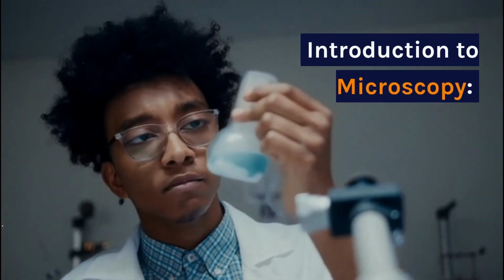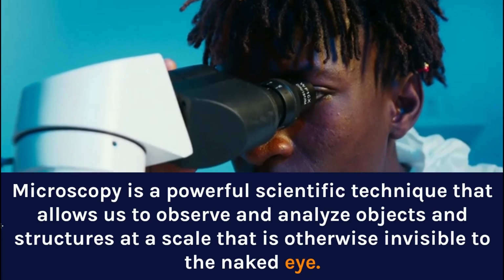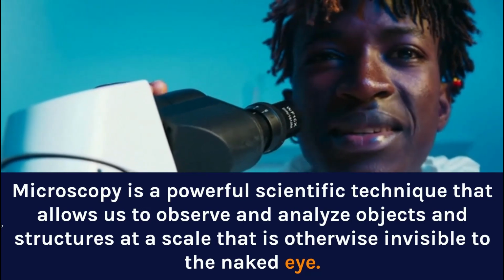Introduction to microscopy. Microscopy is a powerful scientific technique that allows us to observe and analyze objects and structures at a scale that is otherwise invisible to the naked eye.